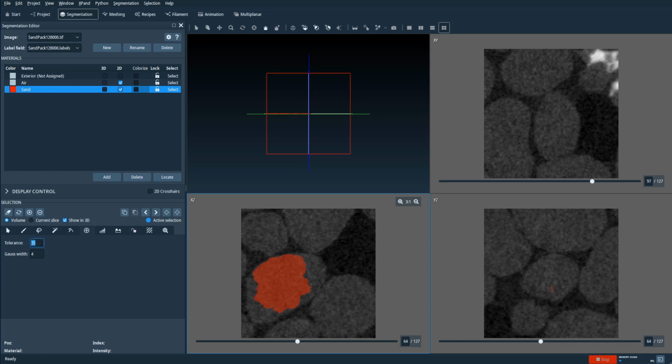Let's say we set this value to a very low value of 1. Then you get more strict in terms of respecting the edges. As you can see here, I'm moving far away from the initial seed point already, but the region is not growing as much as before.